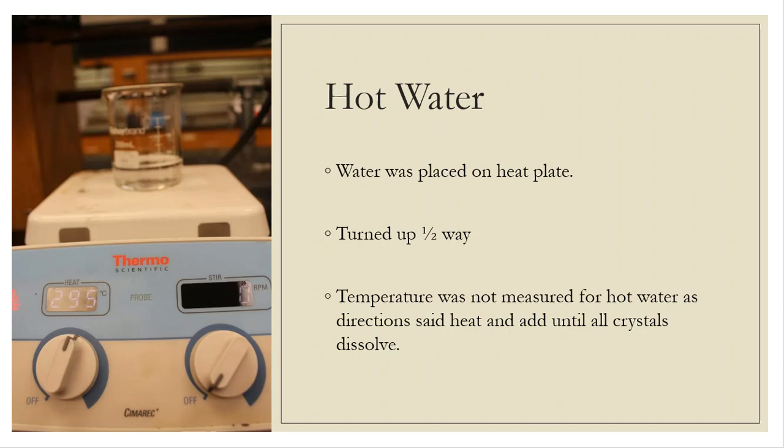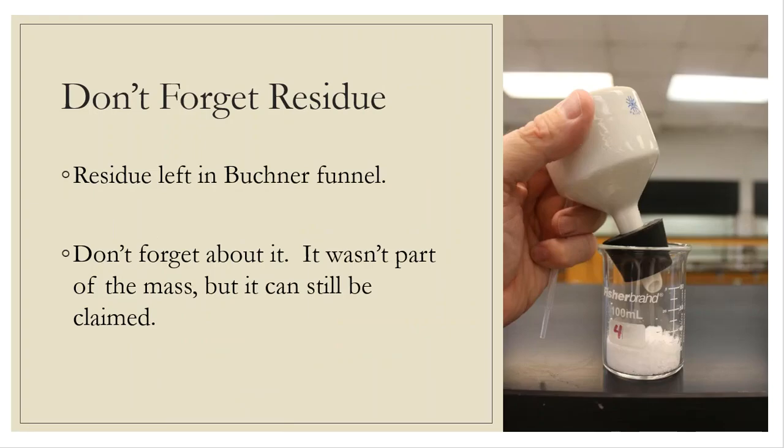Well, one of the ways that I'm going to take care of the residue is that I'm going to take that Buchner funnel that still had some remnant there. I didn't get a mass of that remnant, but that remnant still had some alkane in it, and that alkane I am going to have to get a mass of at the very end. So I said, well, why not take some of that hot water and squirt it through that Buchner funnel just to make sure that I can get all of those crystals out as well. And that's exactly what I did.